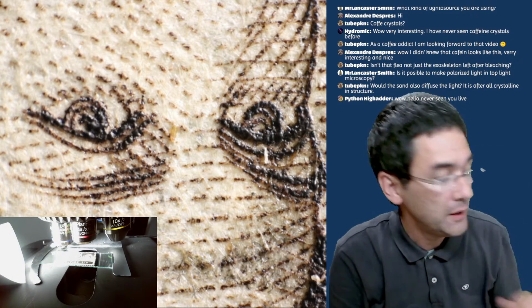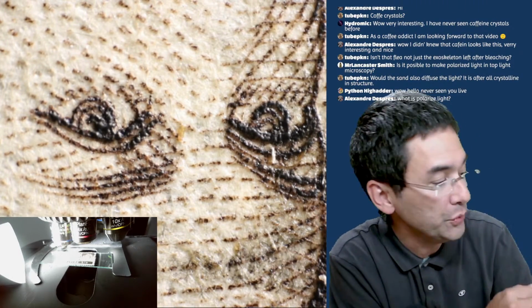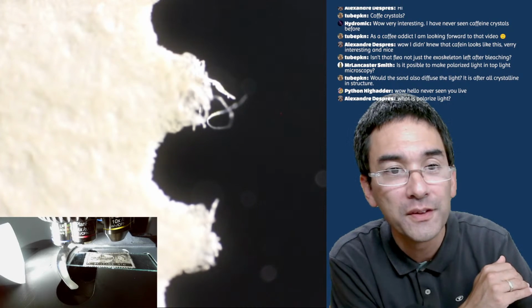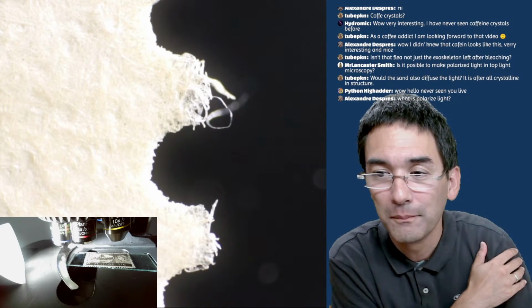So, stamps. One of the things I noticed here is that you can actually see that the print, or the ink, of the stamp is higher than the paper. Also here, let's see if we can see the edge. That's the edge of the stamp. You see that the paper is fiber.